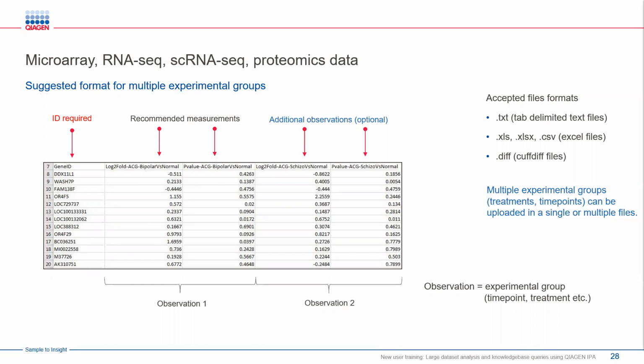So another question came up: is there a maximum number of genes we can input for IPA? I believe the number is 200,000. But when you are analyzing your data, you need to make sure your working list, after filtering for p-values and, let's say, fold change values, contains the most significantly differentially expressed genes. That number is somewhere between, I would say, a low of 100 genes to a maximum of 8,000 genes.